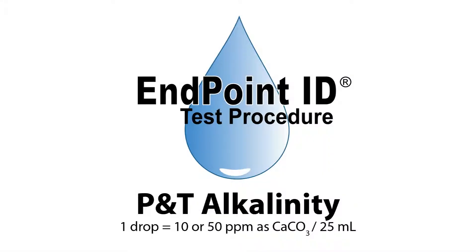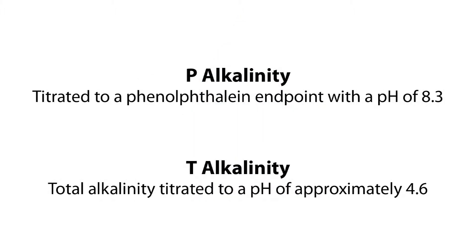This is a demonstration of a P and T alkalinity drop count test kit using endpoint ID procedures. P alkalinity is the alkalinity titrated to a phenolphthalein endpoint with a pH of 8.3. T alkalinity is for total alkalinity, which is titrated to a pH of approximately 4.6.